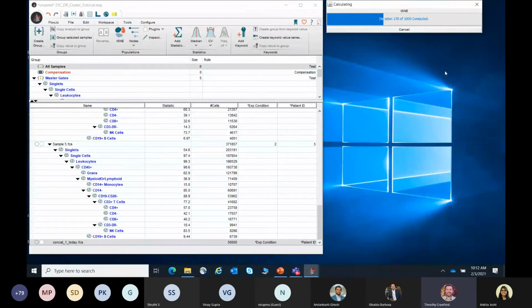And you can do that from the export concatenate platform as an option. For the simplicity of this example, we exported only compensated data. The other point here is whether you select parameters which have been used for cleanup as well, and that is really your option.